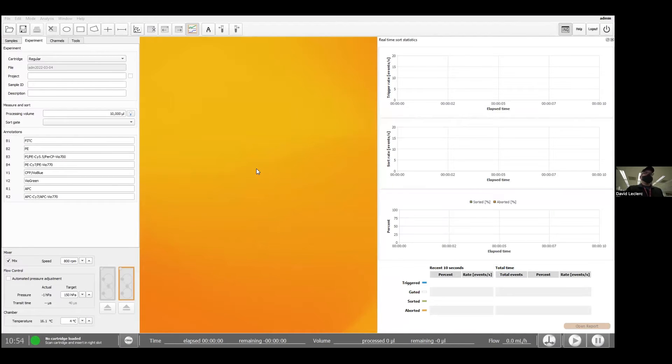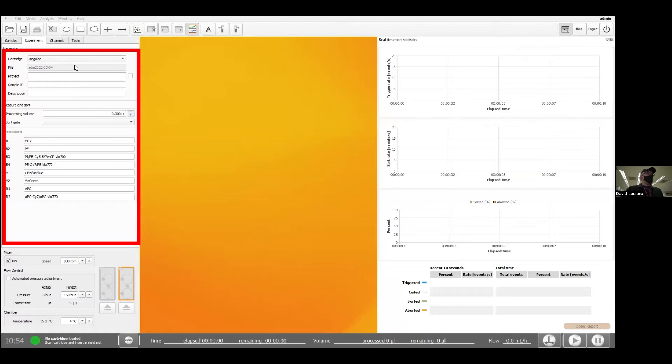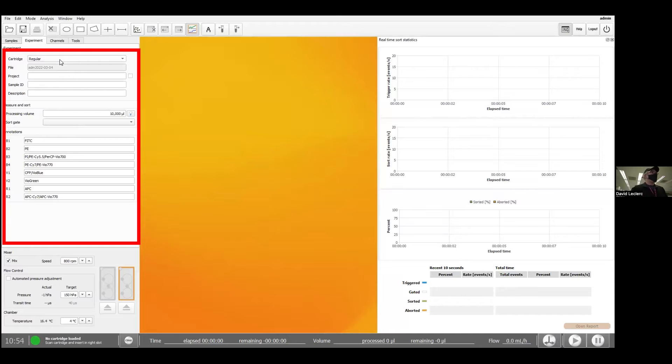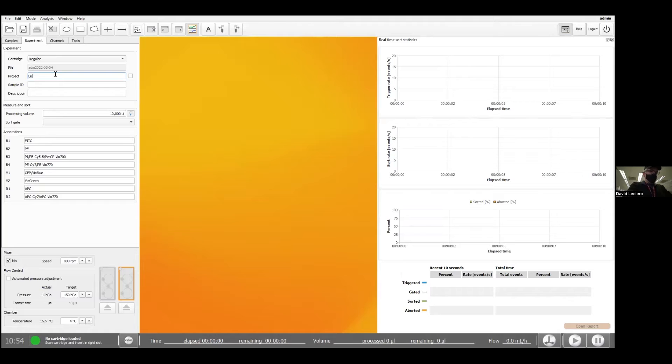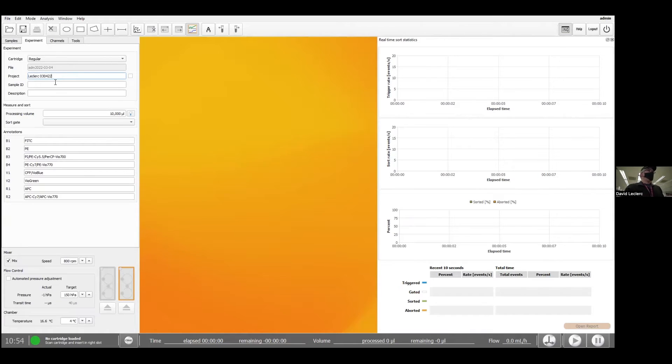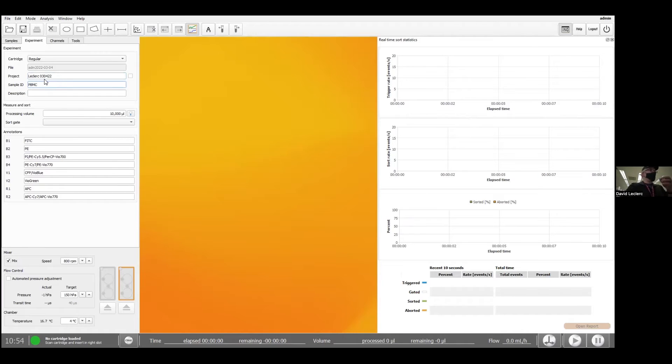What I typically do is start setting up my experiment over here. So I decide on the type of cartridge I'm going to be using. Right now we're using a regular cartridge. The project name will be the name of the folder where the data is going to be stored. And then I have a sample ID. So today I'm running a bunch of PBMCs, actually very cells.